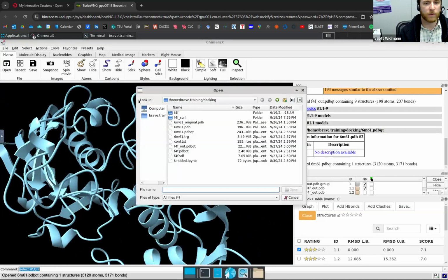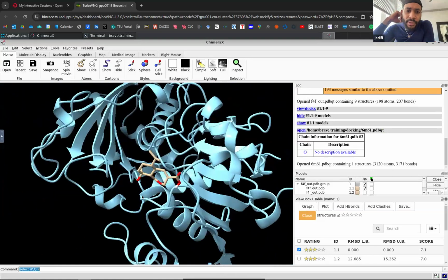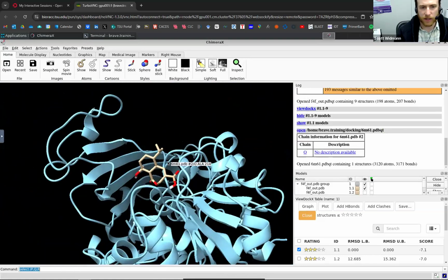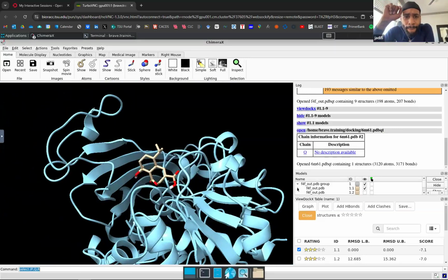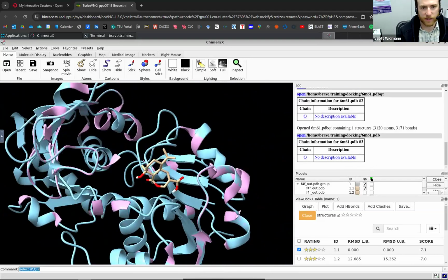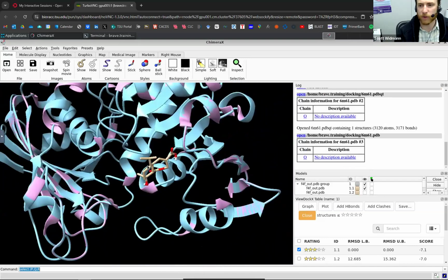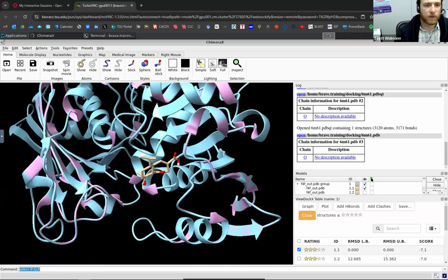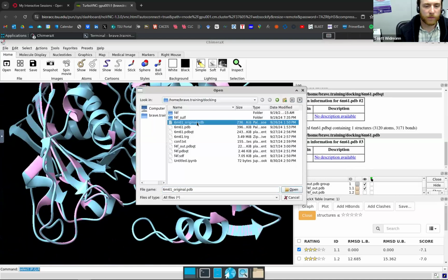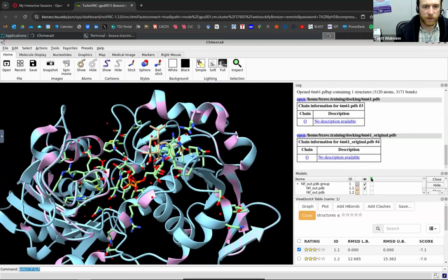So on the 6M61, is there a specific one that you're supposed to choose? Because I noticed there were 3 different ones. Yeah, you can just choose the one that I used for docking, which is the PDBQT. Yeah, so that's the PDB form. It's the same. You can see it's overlaid, and it's trying to show both of them with the different colors. But either one would work. Yep, and see my original. And so that's with the original.